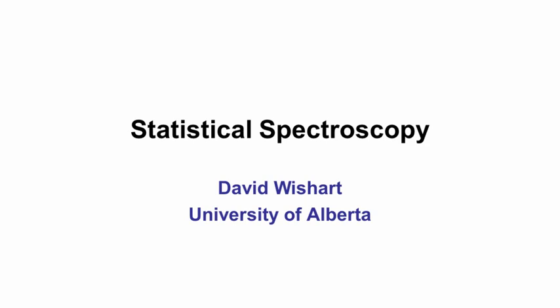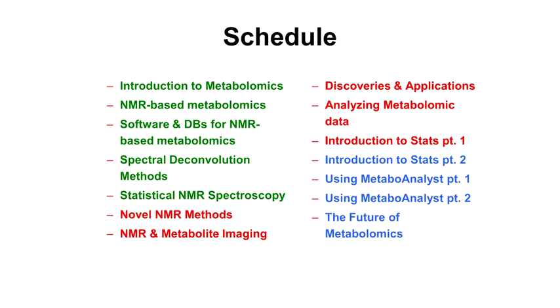Welcome again to lecture number 5, and we're going to be talking about statistical spectroscopy. So, just as a quick outline, for today we've looked at both an introduction to metabolomics, NMR-based metabolomics, software, and spectral deconvolution. So for the last part, we'll be looking at statistical spectroscopy.